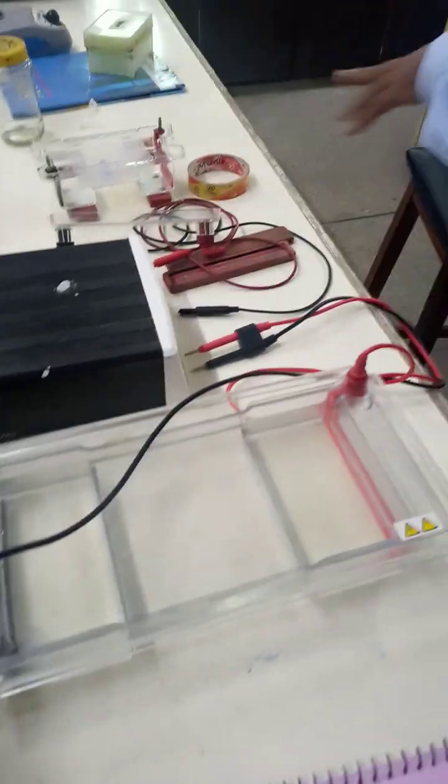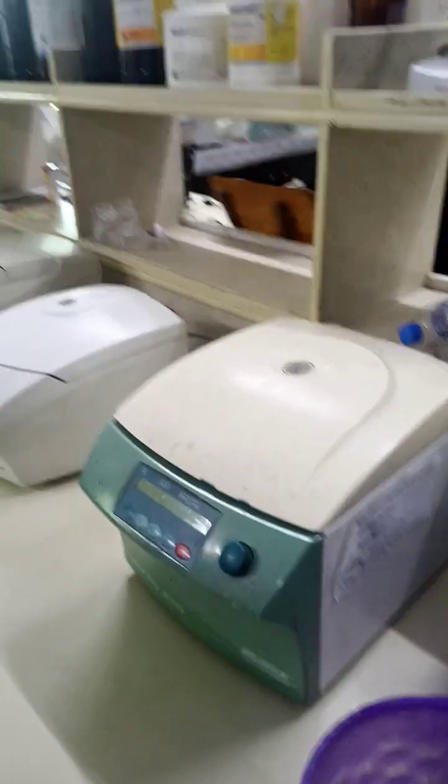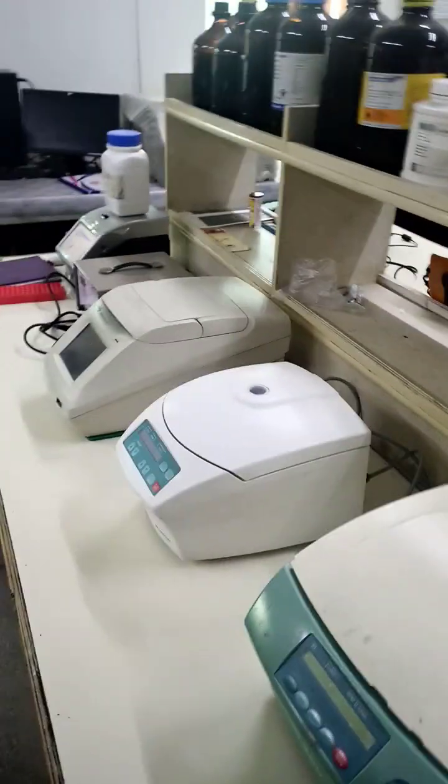We can show you the gels as well. So this is the case of conventional PCR. Here these are conventional PCR. Whatever is the product, we run it on the gel. Then we are able to see the results. But in real time or QPCR, you don't need to go for this. You can directly take the results while your samples are within the tube.